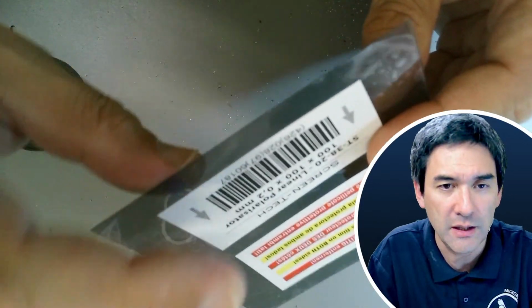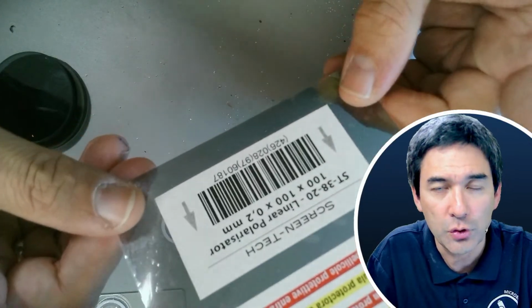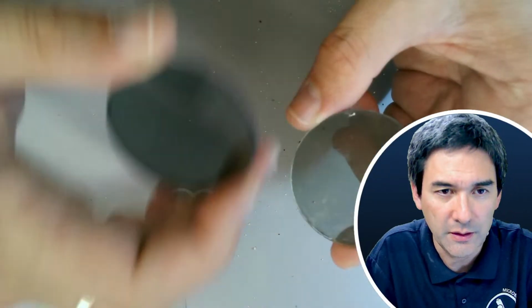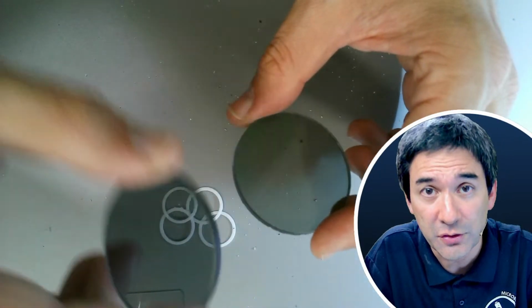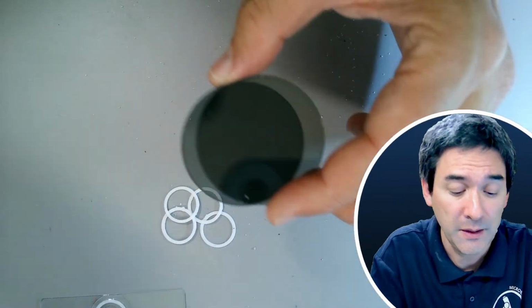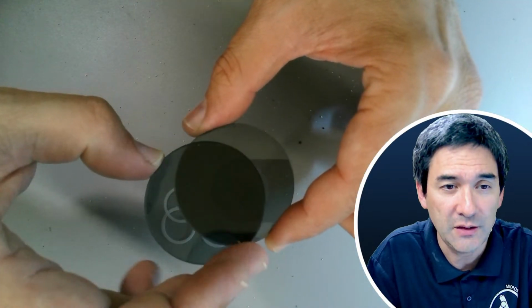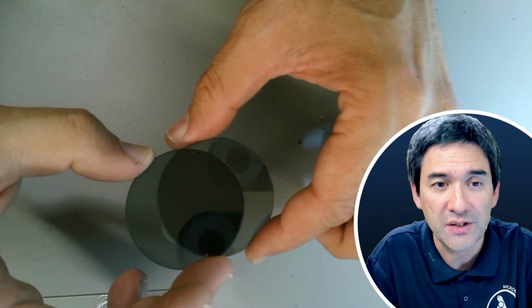So that means you can actually put them also over a microscope slide, if you, for example, want to observe crystals. And these here I bought a long time ago, these were linear polarizing filters for cameras. Now they still sell polarizing filters for cameras, however they are circular polarizing filters, just like those here. And I think again linear polarizing filters are much easier because essentially what you do is you put one here on the bottom, you put one on the top, you rotate it, and you see that there is this crossed position where you're not able to see anything, right?